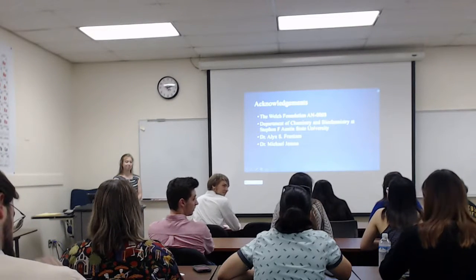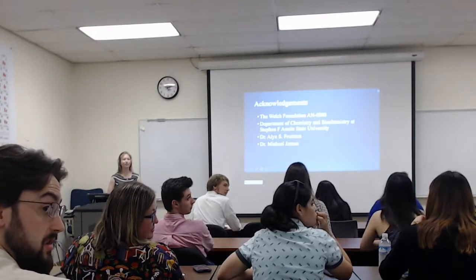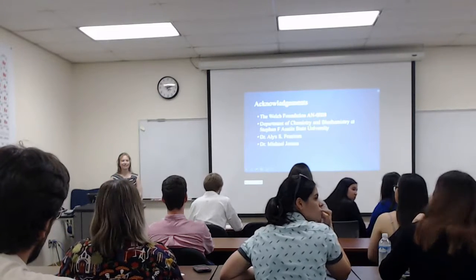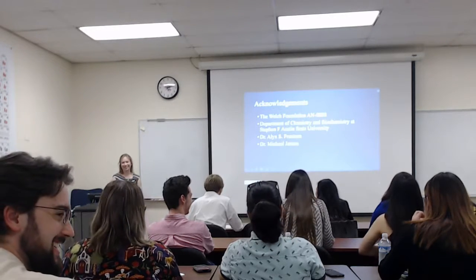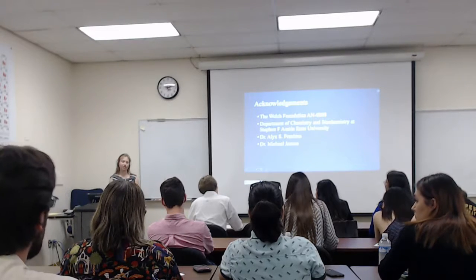Any other questions? How do you determine if your clays are ground appropriately or if you've damaged the edges? Human eye is pretty much the way that we do that. We don't have an actual method for determining how finely ground they need to be.